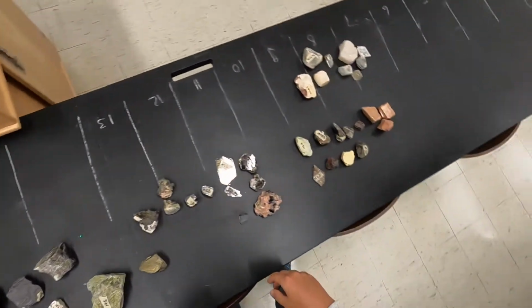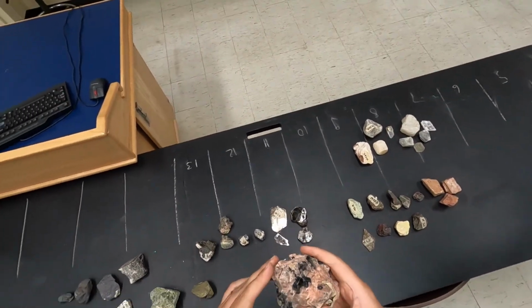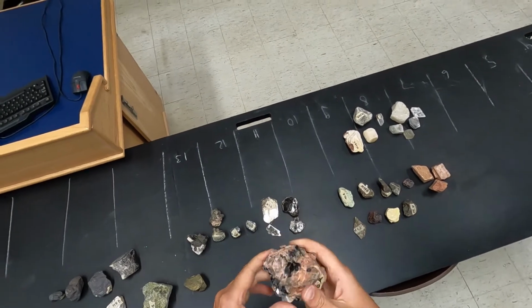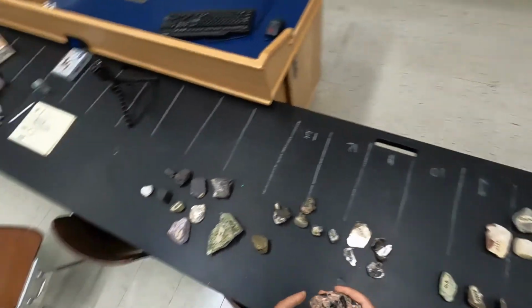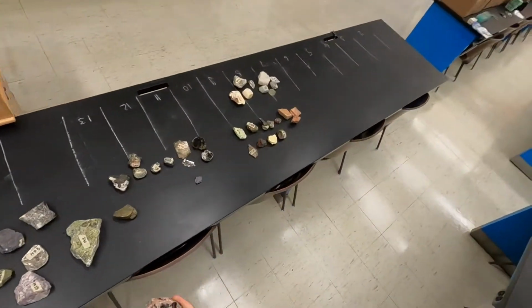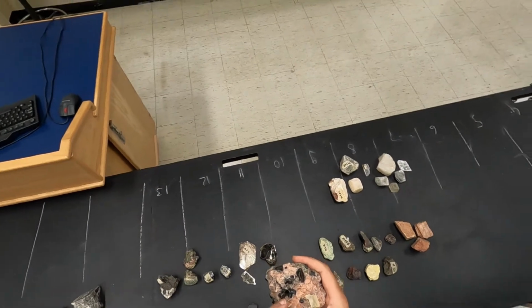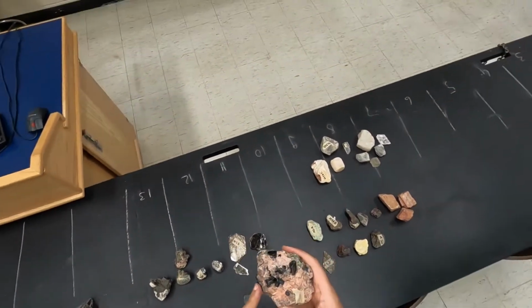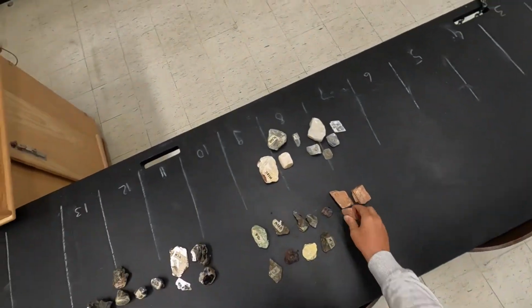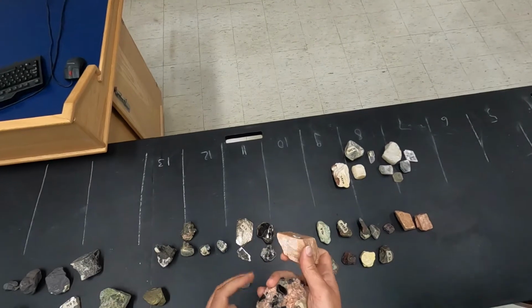Other minerals will be translucent but will have a different color, and this is a good example here, which I believe is a carbonate. So the color is not really a diagnostic criterion for minerals, but in some cases it can be helpful, and for example for the K feldspar it's quite helpful, but you have to be careful.